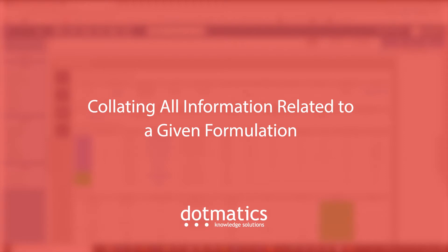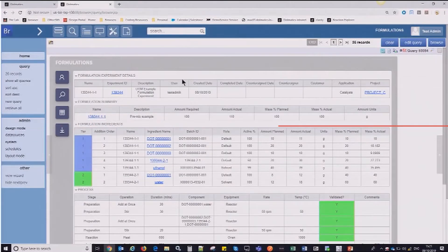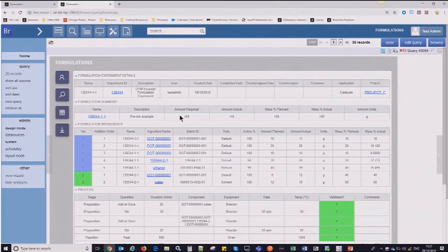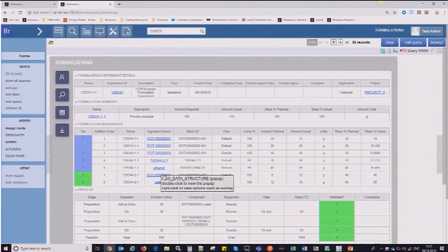The main concept to take home today is that this browser project allows you to collate all of your information related to a given formulation on one page. We've got some information about the experiment details, where the formulation was created, who created it, what application field it sits in, what the required amount was, and then some information about the ingredients.